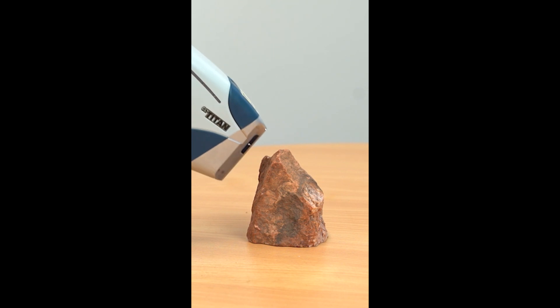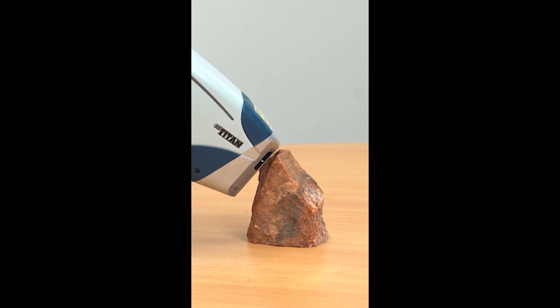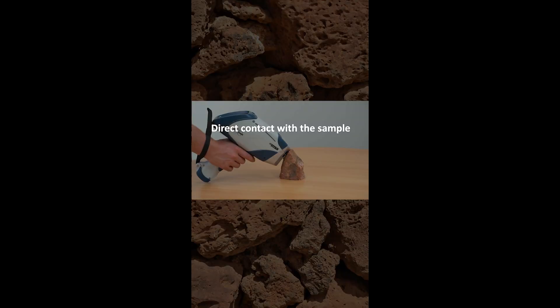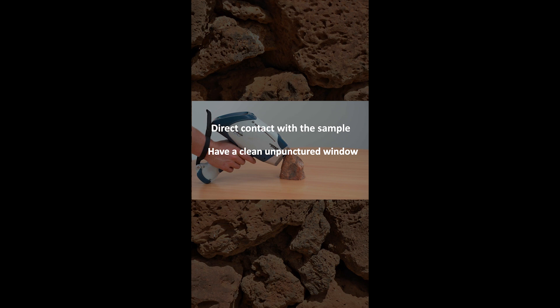So the key thing for taking good analysis is to have direct contact with the sample, having a clean, unpunctured window on the instrument, and analyzing for the full recommended time.